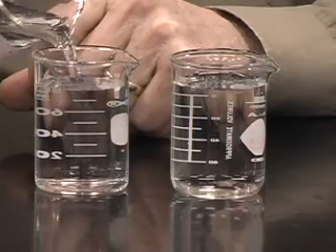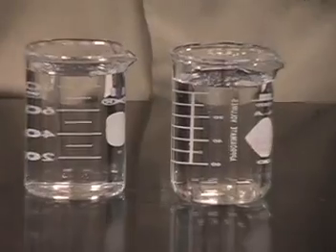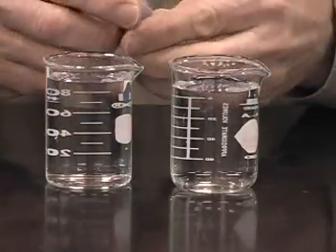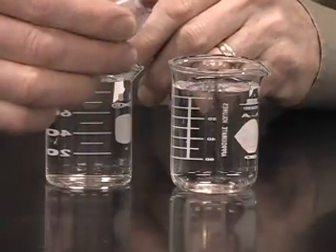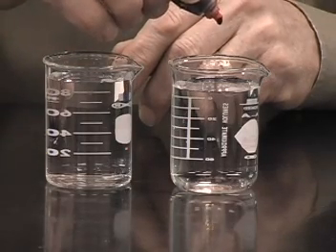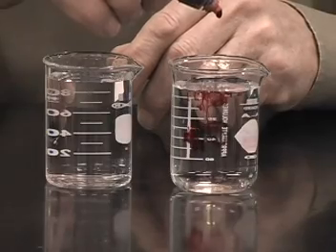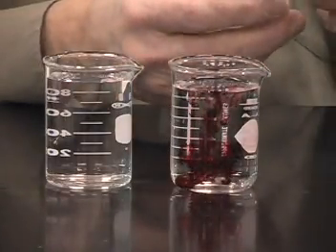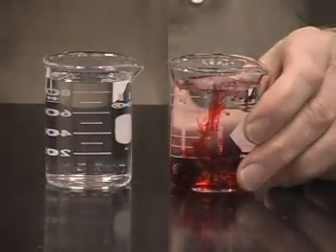So this is just plain water. As my pollutant, I'm going to use some red food coloring. And I've weighed it. One drop is approximately 0.05 grams. So I'm going to put 2 drops in the 100 mils. That means I've got about 1/10 of a gram of food coloring in here.